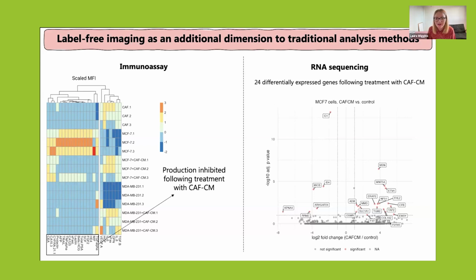And again, in the literature, we found that these are linked to increased tumorigenesis and aggression in cancer cells. So it looks like there's a neat way of tying it together that the conditioned medium induces phenotypic changes that actually links with the underlying biology of the cell. So that's just a nice idea of how you compare phenotypic information with already traditional techniques.